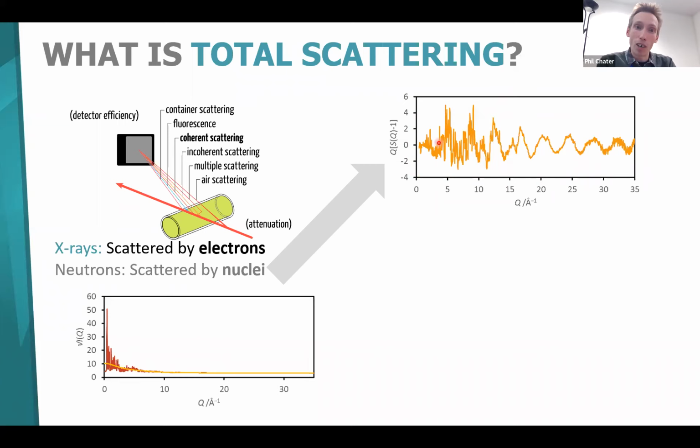And it really emphasizes all this other information that was completely absent when we just looked at our Bragg data set. So like I said, this is exactly the same information as we originally had down here. But now, because we're dividing through by this form factor and correcting for these other features, we're seeing a lot more information. And all of this information here is due to short range effects in our material.